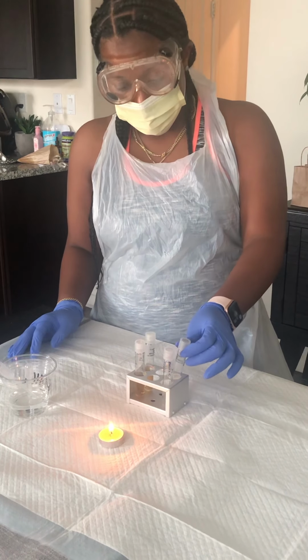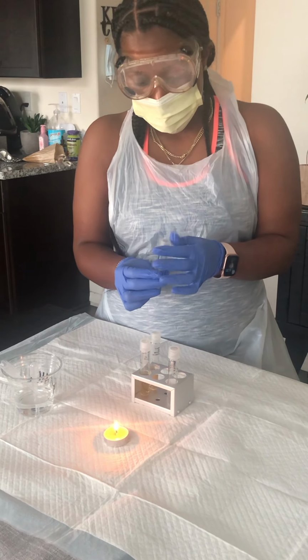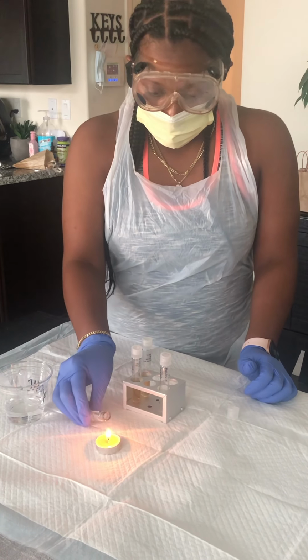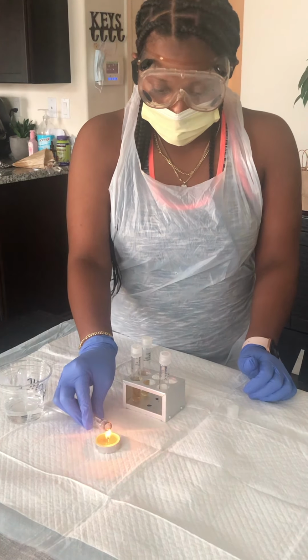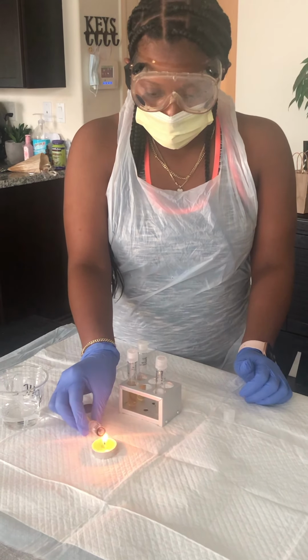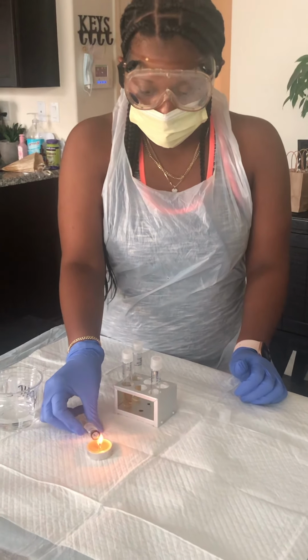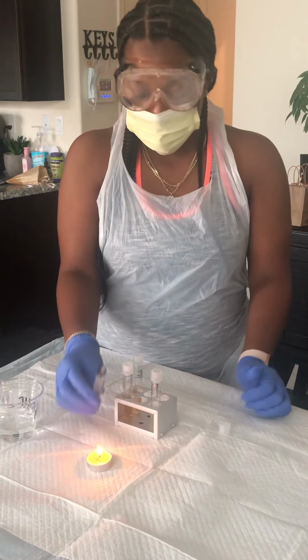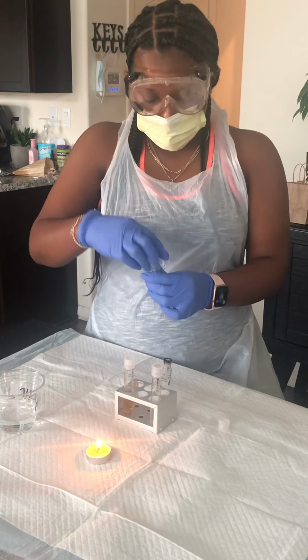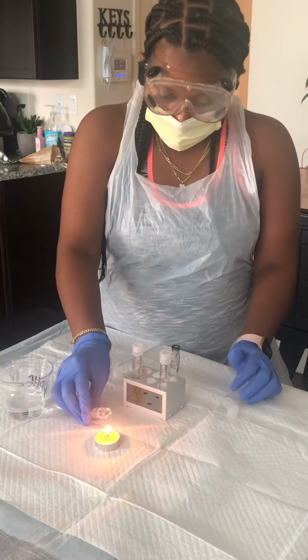So we're going to start with the E. coli first. I'm going to uncap it, and I'm going to place that, and I'm going just to sterilize the lip of the E. coli. And I'm going to place this here. I'm going to uncap my broth, and I'm going to just sterilize the top.